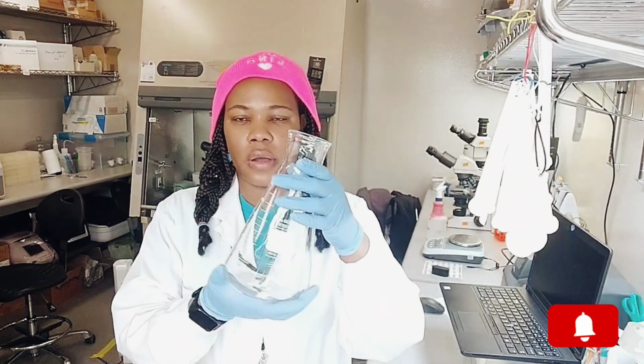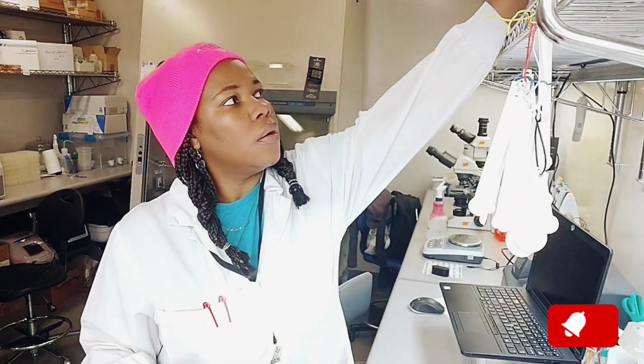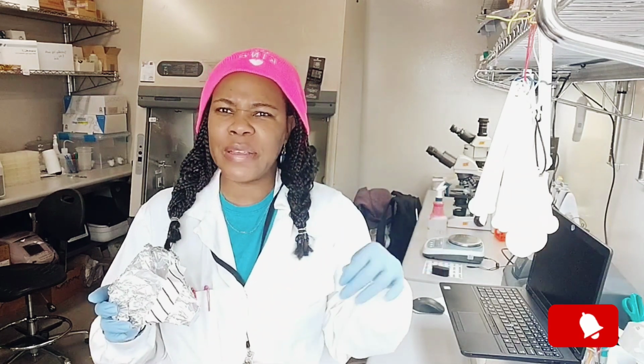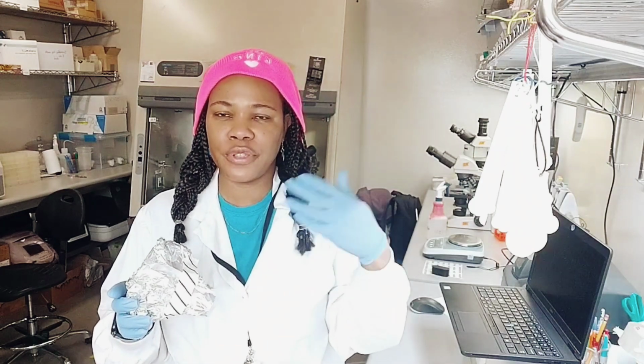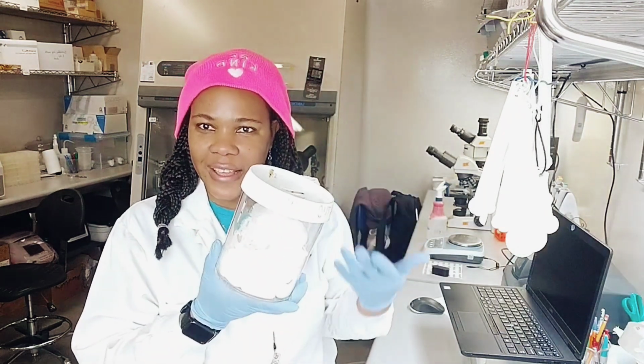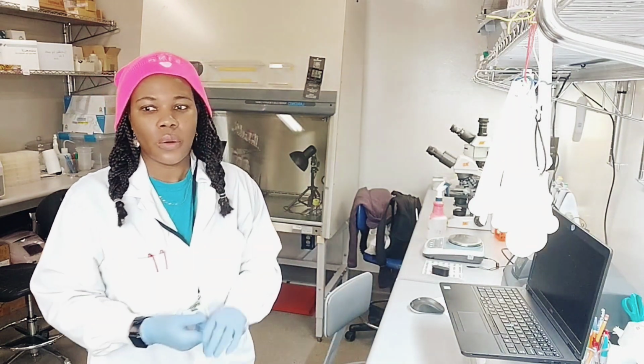I am going to make up 1 liter, 1000 ml. So I have a 1 liter Erlenmeyer flask, a sterilized funnel, because I'm going to filter the spore suspension to remove any large pieces of hyphae or any debris like pieces of agar, because I might gouge the agar when I'm scraping them. Sterile cheesecloth, again for the filtering. Water.